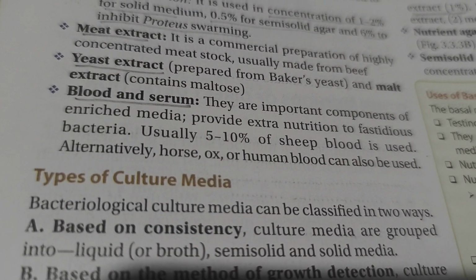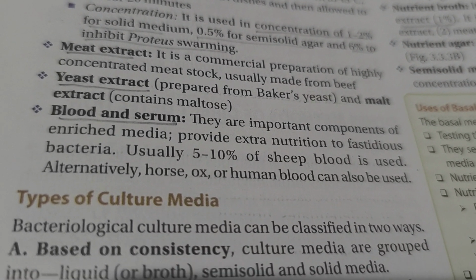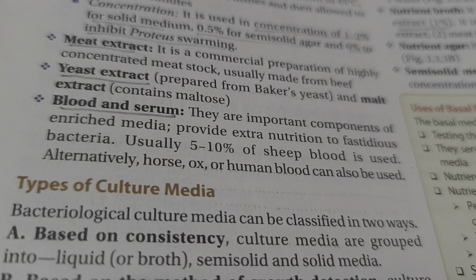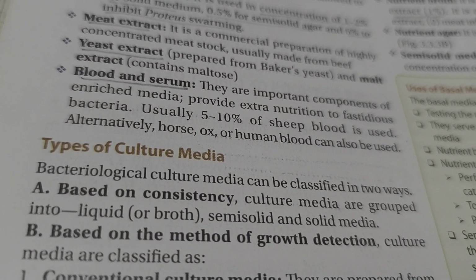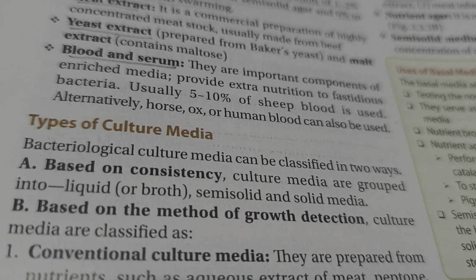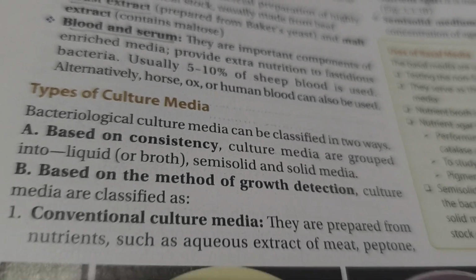Yeast extract is prepared from baker's yeast, and malt extract contains maltose. Blood and serum are important components of enriched media and provide extra nutrition to fastidious bacteria. Usually 5 to 10% of sheep blood is used. Alternatively, horse, ox or human blood can also be used.